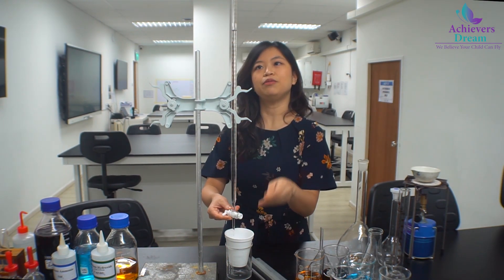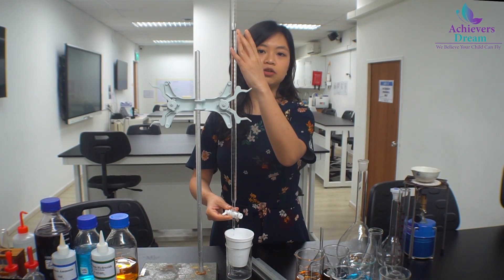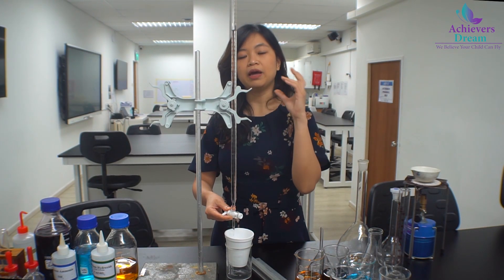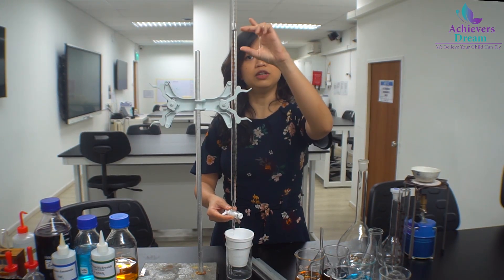After doing that, we have filled our burette — in this case, filled to the 10 cm³ marking. We will be adding the acid in 5 cm³ intervals, so adding in 5 cm³ fixed volumes each time.